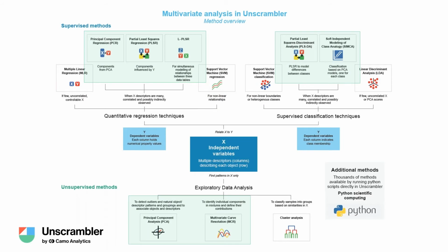The mostly used methods in Unscrambler are so-called explorative bilinear methods. These methods return not only predictions or classifications, but also an interpretation. It allows you as a domain expert to actually tell why the model is working like this, what the underlying phenomena being explained are. And it will also flag deviations for you. So if you have outliers in your data or outliers in your process, if you apply this model for real-time use later, then they will be flagged.